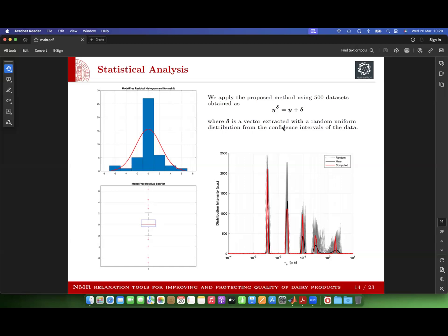Actually, I would say that on the contrary, if you have such peaks, it means that you do not have motion, or you have very slow motion. For instance, you have a fraction of immobilized biological molecules, and this fraction gives this effect. So this is a completely different phenomenon. Also, if you have paramagnetic systems, you have several other interactions, and one may not describe the relaxation data in terms of a Lorentzian function.